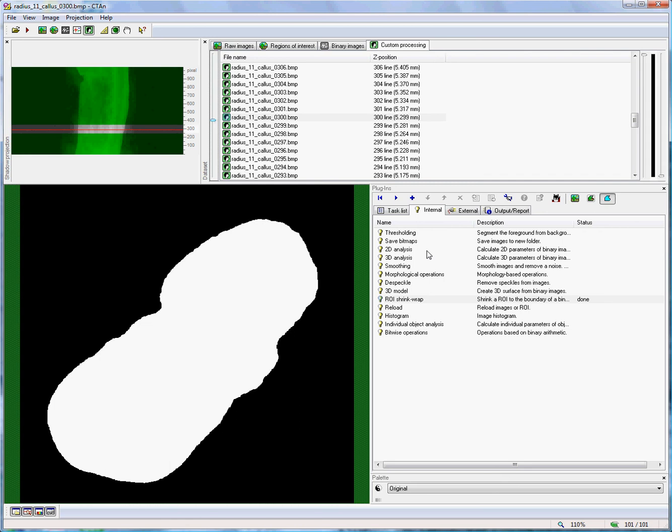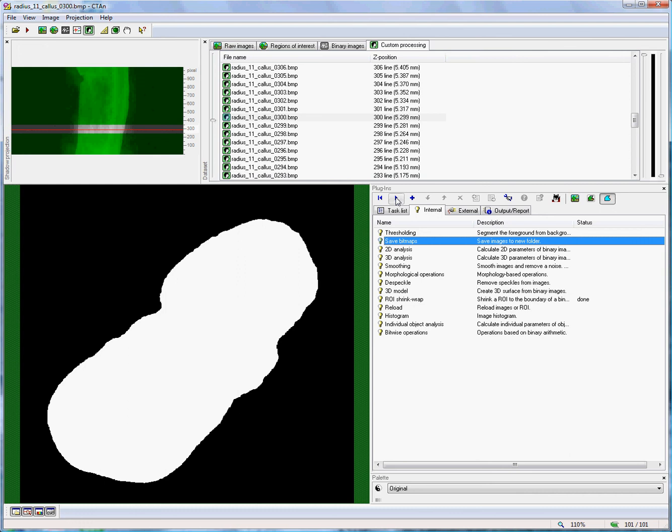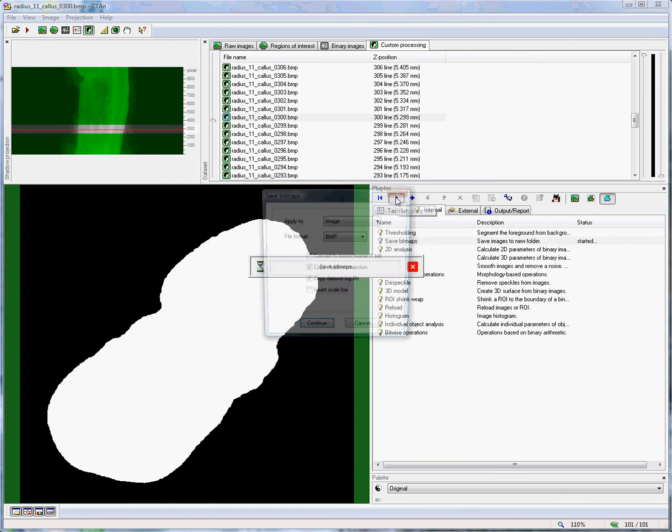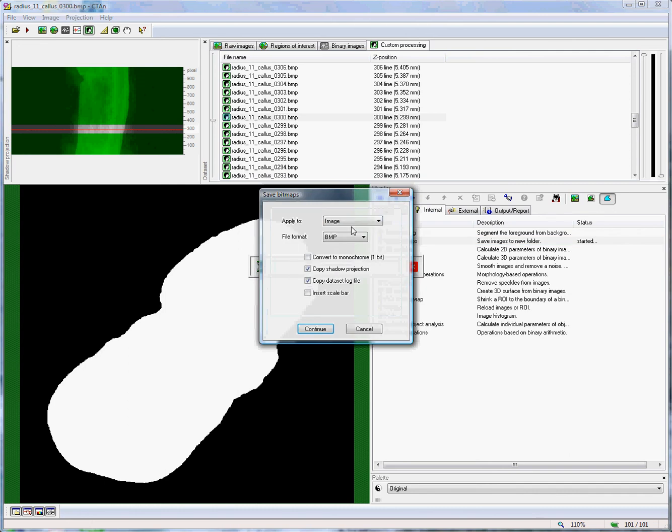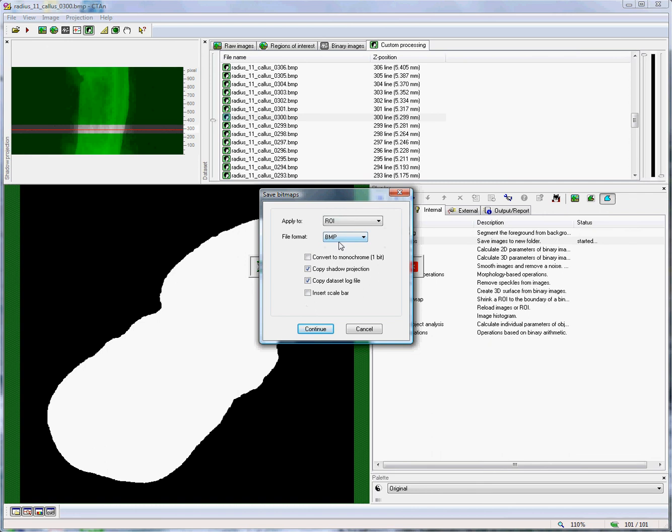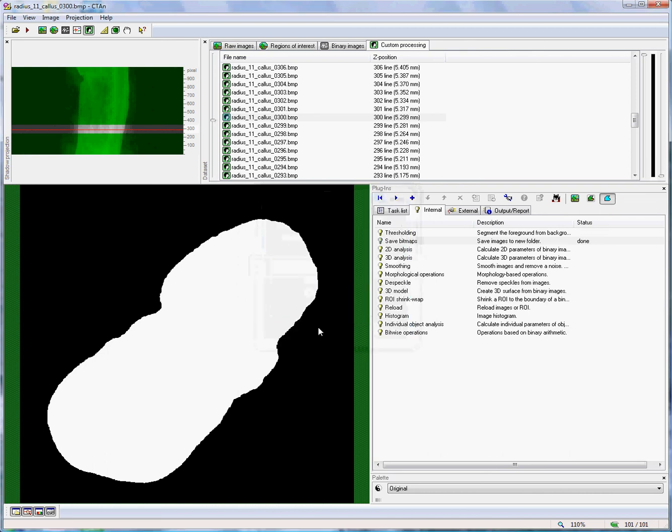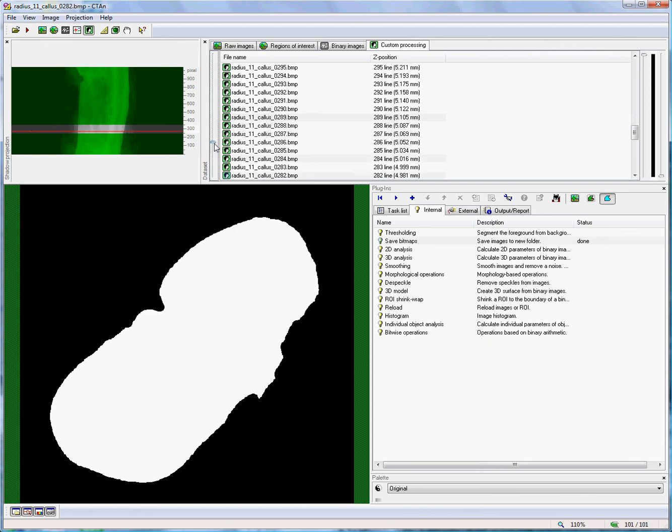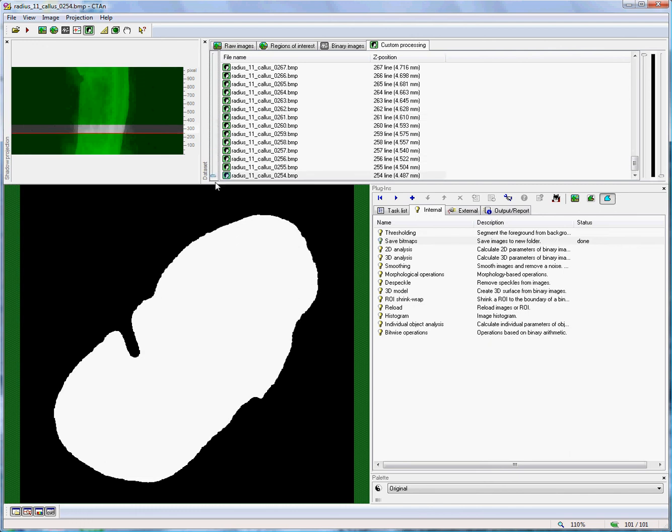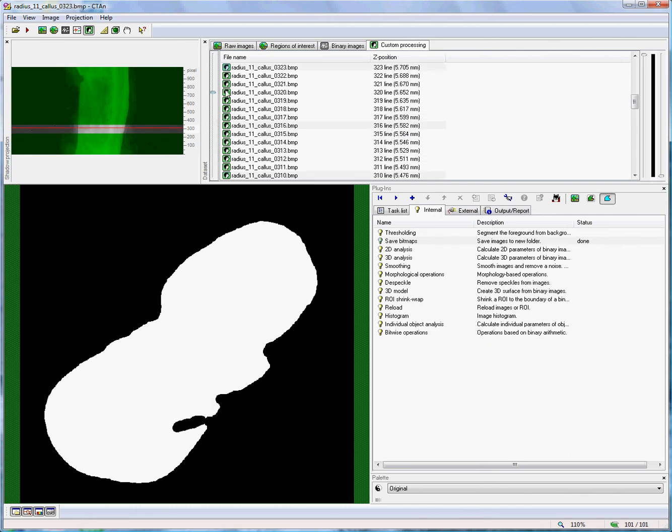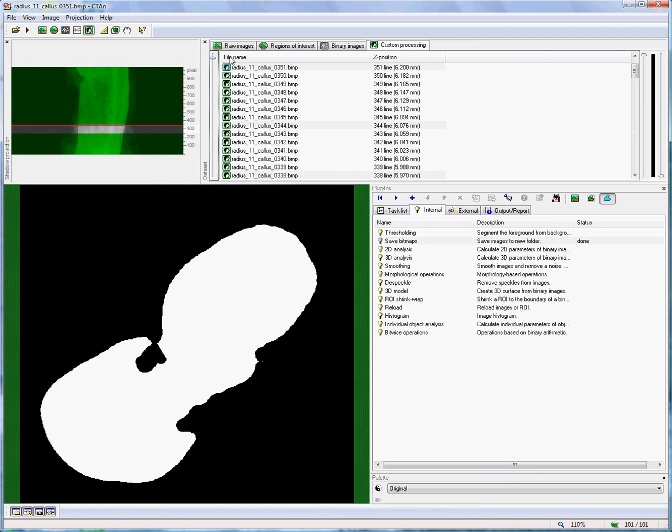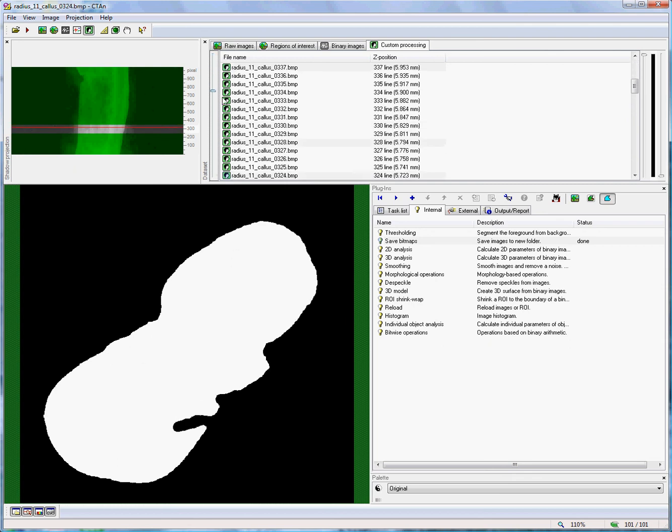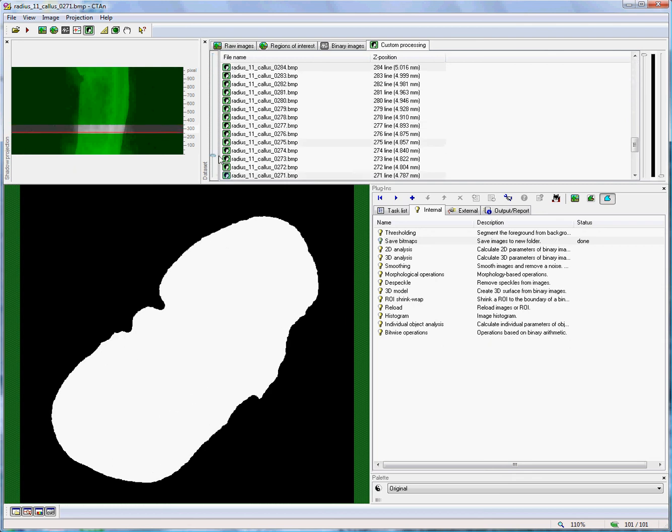Note that it is always a good idea if you include shrink wrap in a task list to finish the task list with the save bitmaps function. Now, save bitmaps can actually save a binary data set of either the image or the image inside the ROI or the ROI itself. And, in the case of BMP, it can be converted to monochrome. If we save the ROI, what that means is that after the operation of the task, for instance, if we have run it from the batch manager, we can inspect the region of interest that has resulted from the shrink wrap and assess whether it is successfully applied or not.